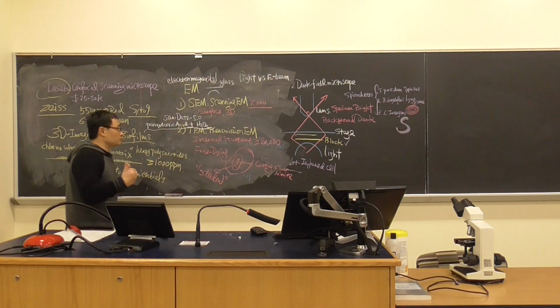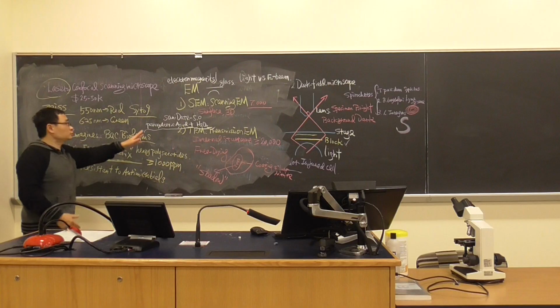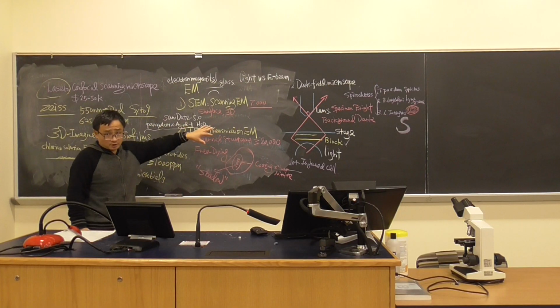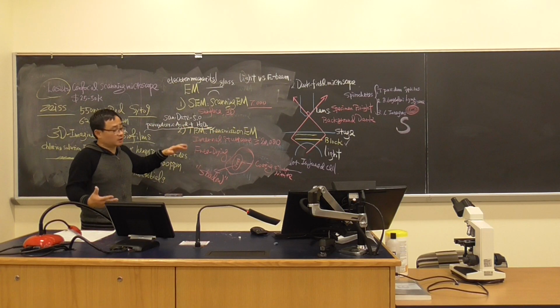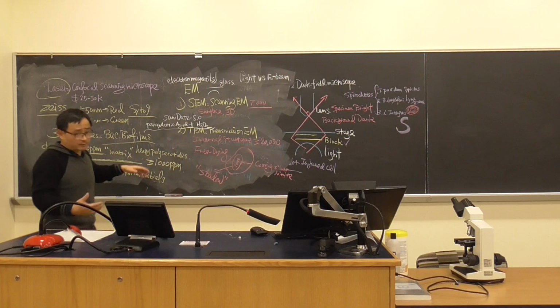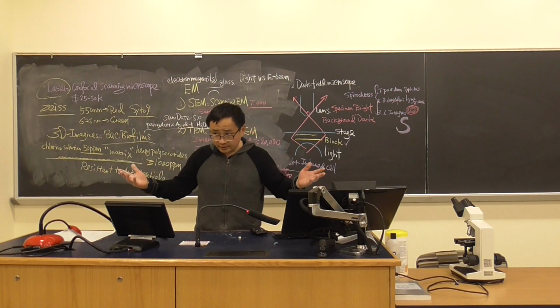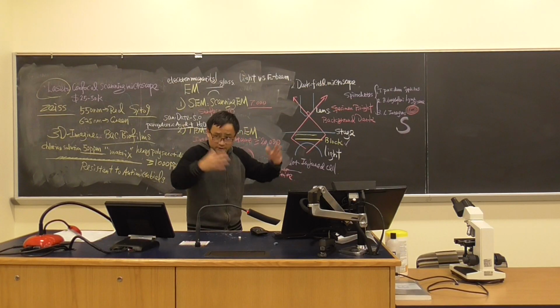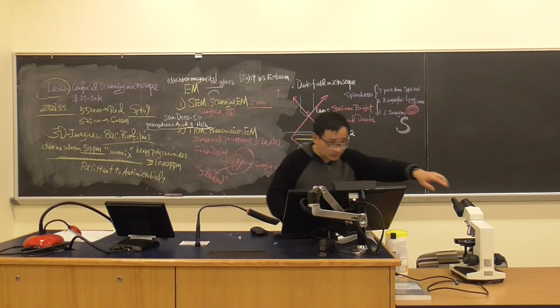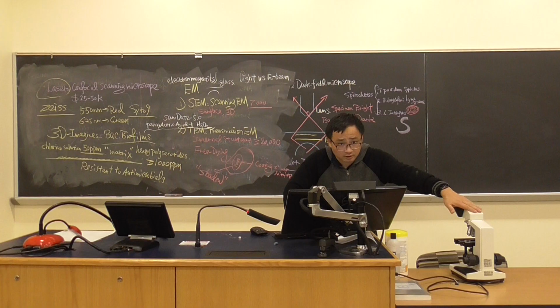Now for us, when we are food microbiologists working for the local community, we want to see the mechanism a little bit, because then we will understand well how they kill bacteria. So that's why the laser confocal microscope and atomic force microscope come out, because basically those are research based. And some of the microscopes are clinical based. But light microscope is more well established, about 100 years, so they're used in the lab a lot.